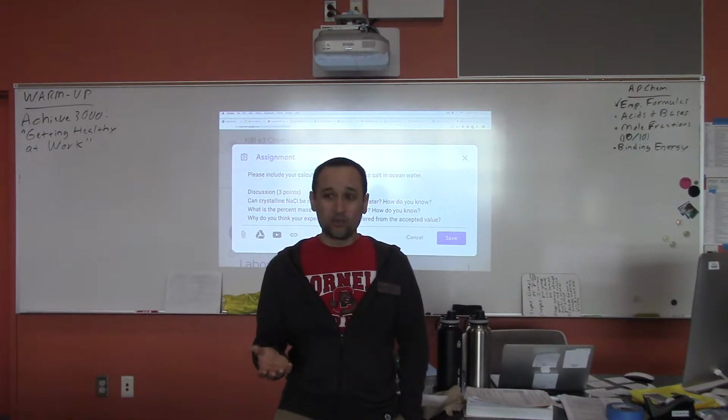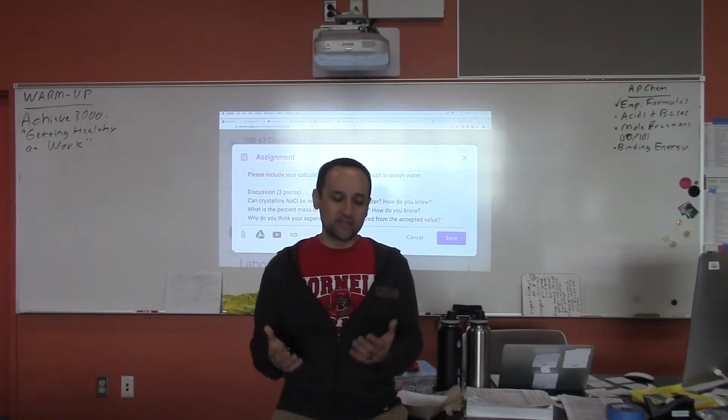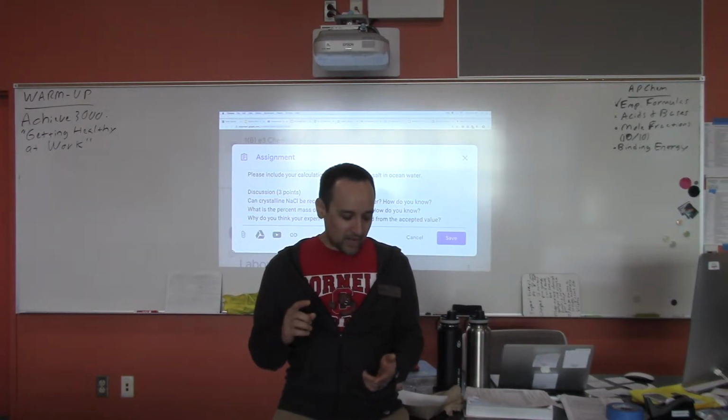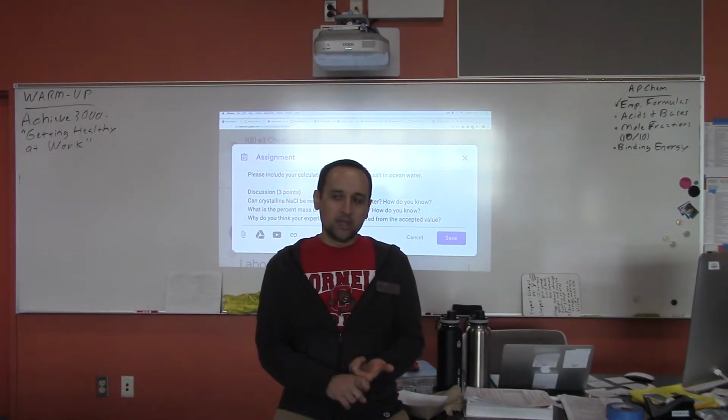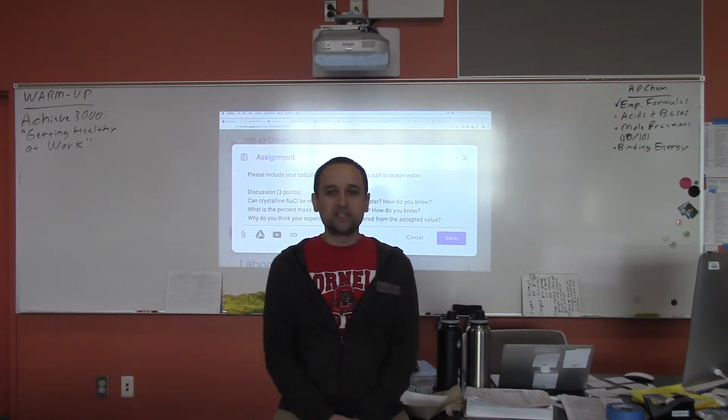But that experiment, are we going to do 32 of those experiments in 2 days with a limited number of beakers? No, right? But this is the kind of thing that scientists reflect on. They say, hey, you know what? My methodology had this advantage. It got the work done quickly, but it also had the disadvantage of giving me an inaccurate result. Okay. So we could change that methodology, right?